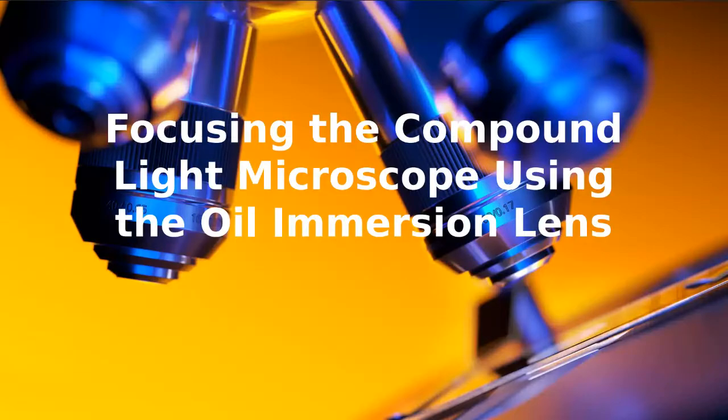So when we're using the 100x objective, the oil immersion lens, the lens is so powerful that if you try to look at the images that you want to look at without having any kind of correction, there's going to be a lot of distortion. And so what we use for correction is immersion oil, right?